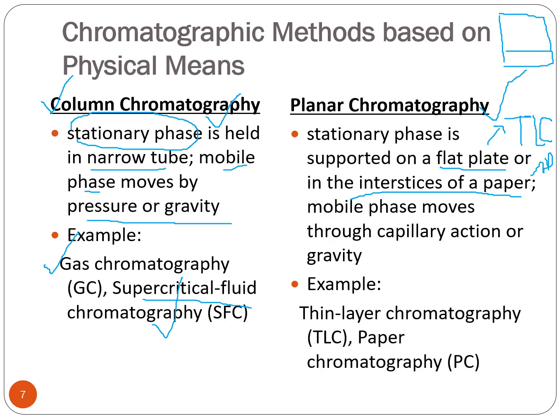You ada food colouring, macam-macam colour tu you pun titikkan dia atas paper chromatogram tu, and then you pun letak dekat dalam solvent, tutupkan dia, and then you boleh tengok the food colouring is separated into a few component. Okay, ni adalah konsep planar chromatography.